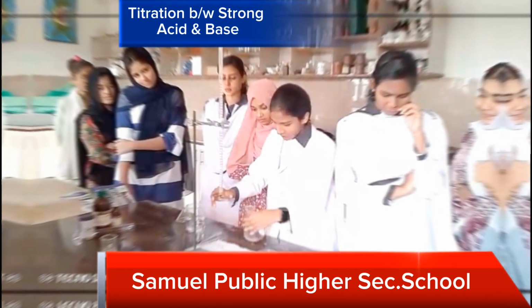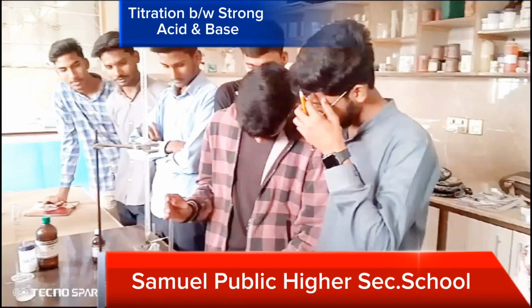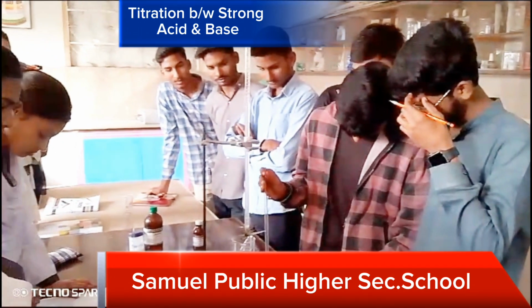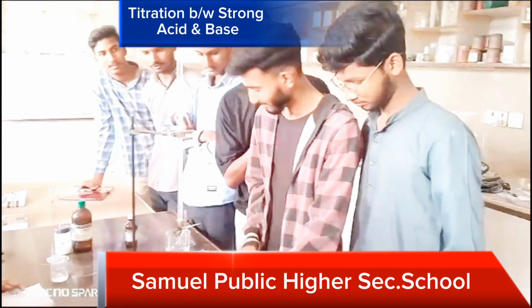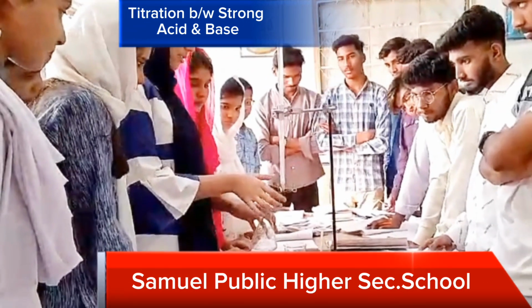First of all, take the sodium hydroxide base in a burette and fit it to the 0 mark point, and note this reading in your observation column.